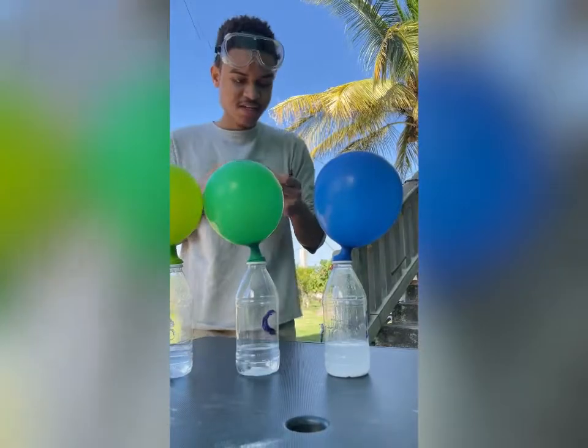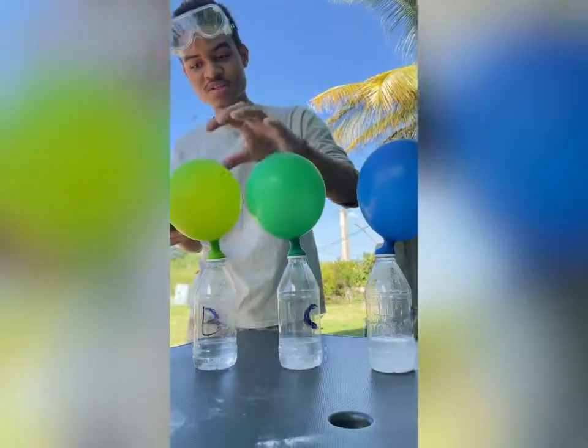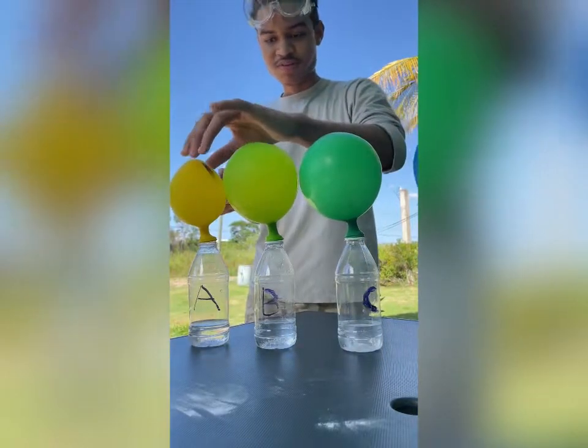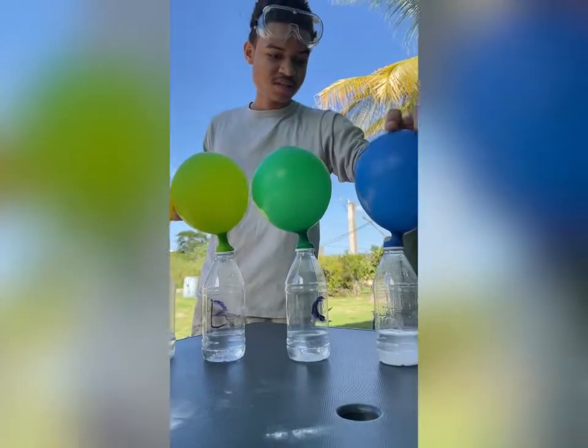And we can see that the pattern so far, according to what we had first established, was the smaller the amount of baking soda, the less carbon dioxide will be produced. So the first is the smallest, the second is smaller, the third is big, and the fourth is the biggest.